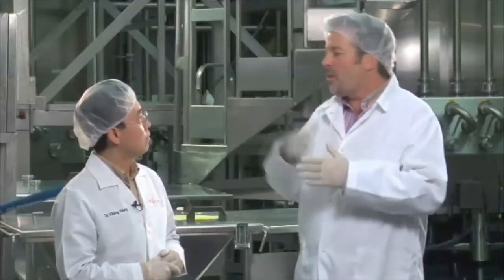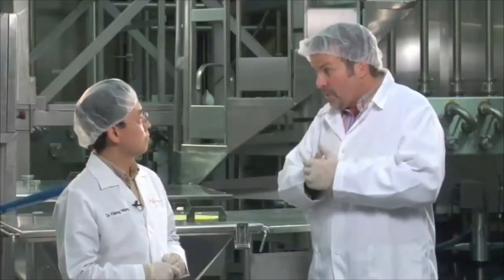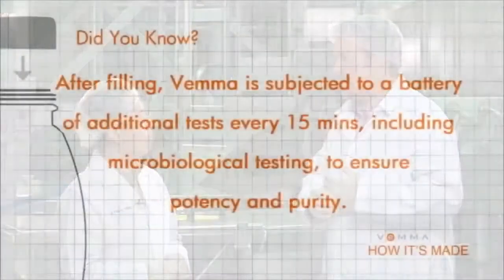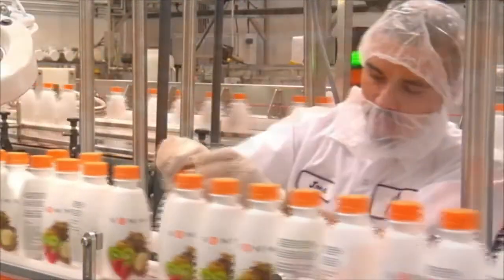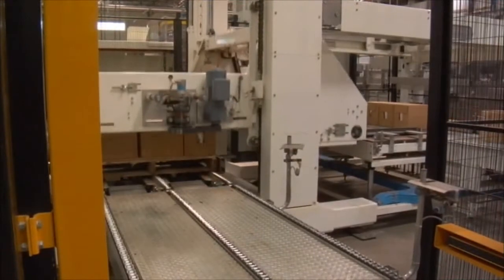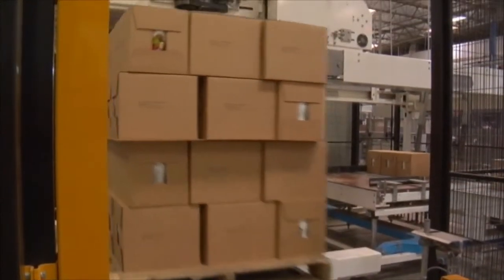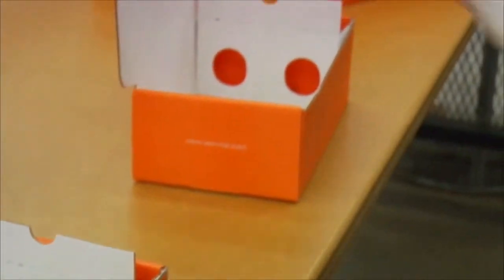It's very impressive. And during this whole process, talk to us a little bit about the QA/QC procedures that go on before the raw materials are actually blended together. But then tell me about the quality control processes during the manufacturing process. Well, during the bottling process, we take bottles every 15 minutes and we test for pH, brix, and titratable acids. So every 15 minutes you do a quality control test? Yes, we pull samples off the line. When the products arrive in our warehouse, we again do an extensive quality control. So you quarantine them? We quarantine them and we pull samples again randomly, and we test the samples for pH, brix, titratable acid, and also microbial content to make sure the product is clean, ready, and safe to be used.